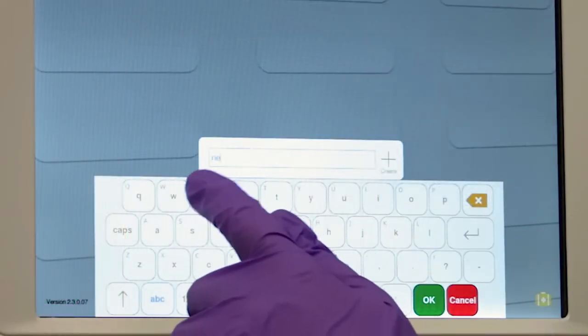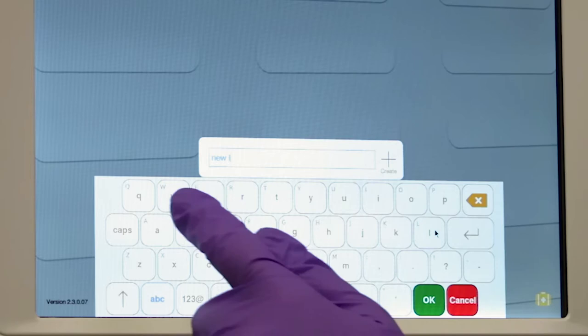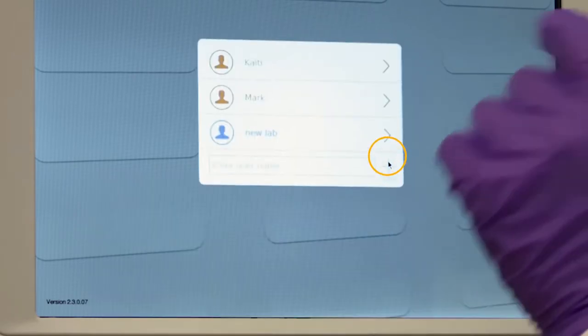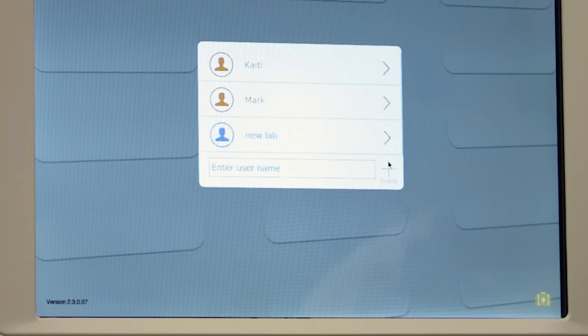If you're a new user, type the desired username, click the plus sign, and the new login will be entered.